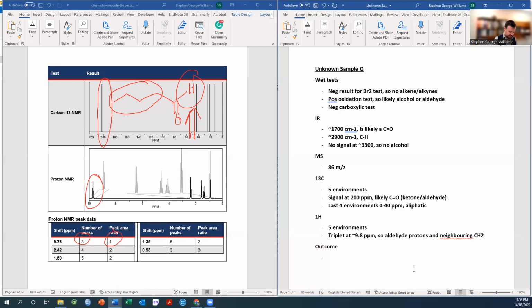After that, there's a lot to unpack in terms of the number of coupling environments, but very quickly, we're going to use this to confirm the chain that I've drawn above. I would expect the next environment down to be these 2 protons, which means that they have 3 neighbors in total. So I would expect a quartet, and I would expect an integration of 2. If I have a look, the next signal down is indeed a quartet, and we're told it has an integration of 2.